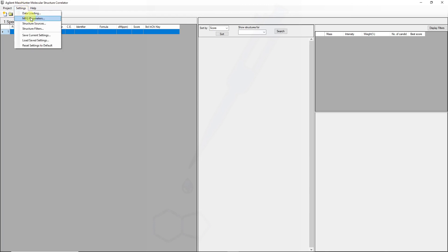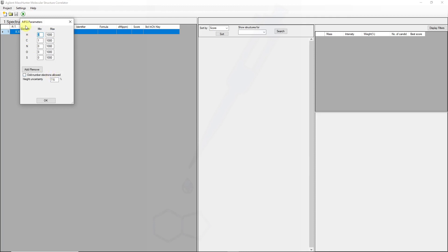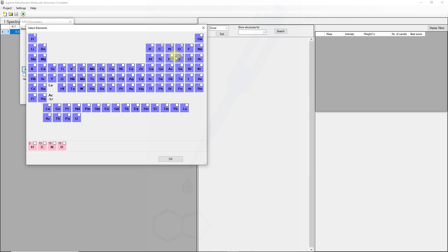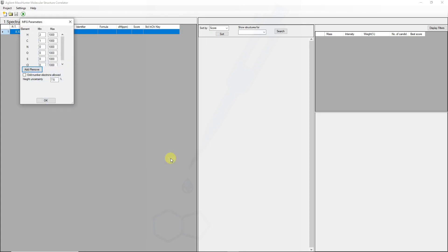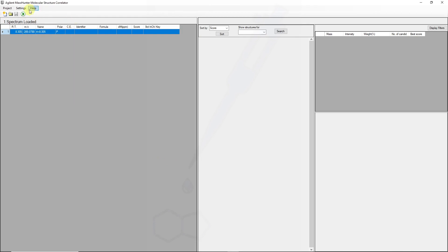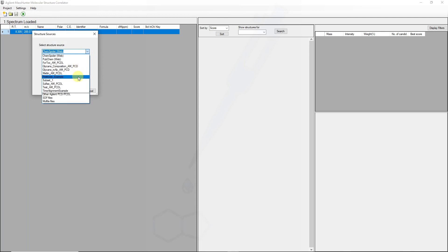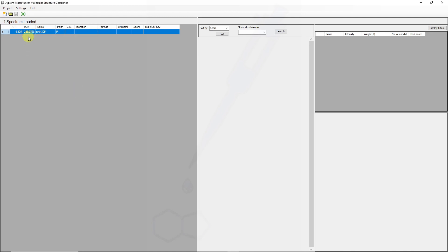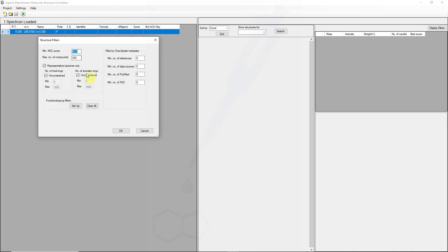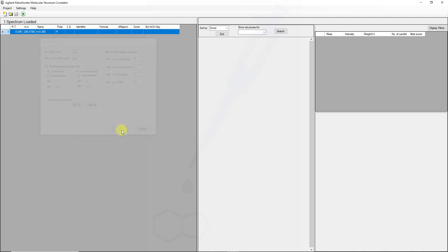For my MFG settings, my Molecular Formula Generator settings, I would like to add chlorine because I know from the isotope cluster structure there was a chlorine present. When I select my structure sources, I'm going to go for one of my PCDLs first, and I'm going to search only for the five best formulas. Other settings like structure filters and minimum MSC scores can be specified. The maximum number of compounds we can tailor in subsequent searches.